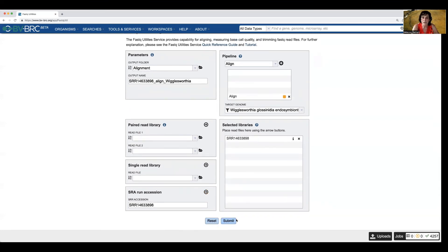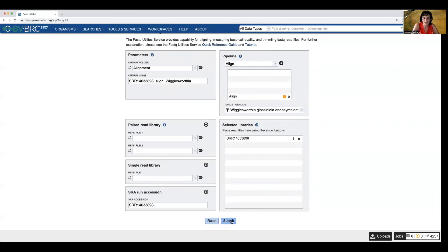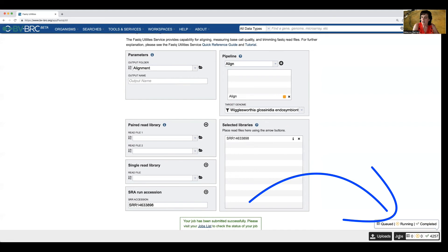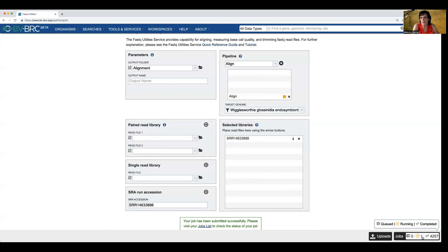And now look, here's the submit button. It's that glorious blue, meaning that we can submit it now. So let's click on that. And it says it has submitted the job. And pretty soon we'll see it down here in the jobs monitor. And it just popped up that it is currently running, although I suspect that means it's actually queued at this moment.